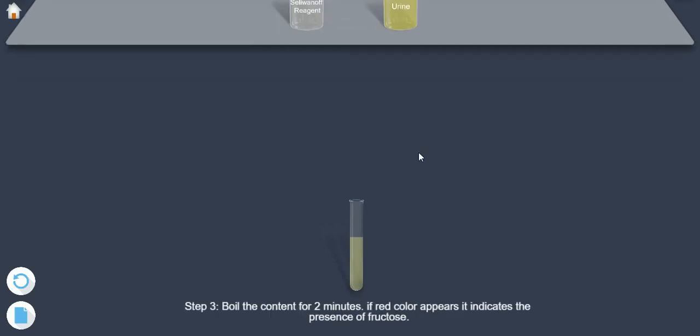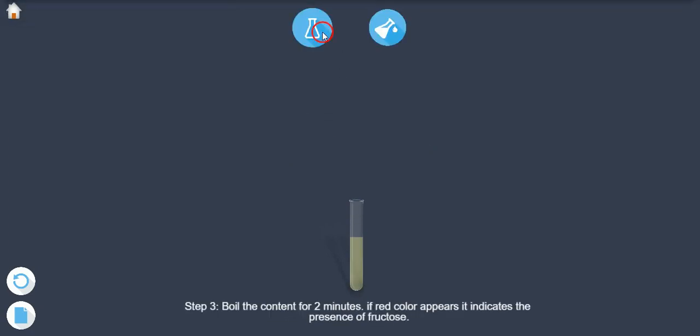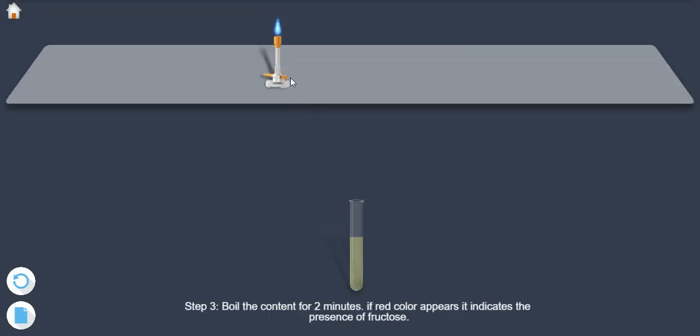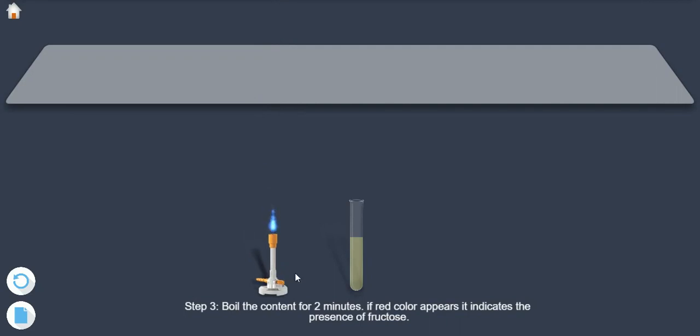Step 3: Boil the content for 2 minutes. If red colour appears, it indicates the presence of fructose.